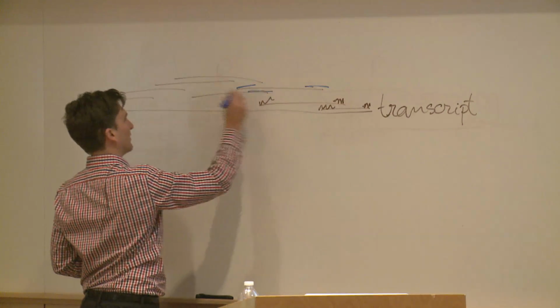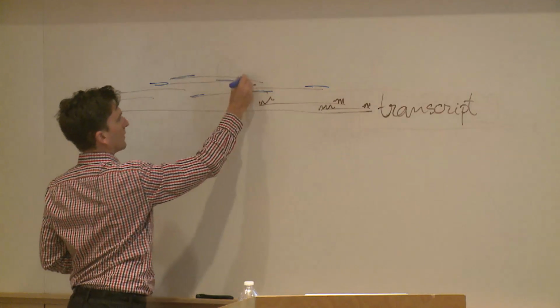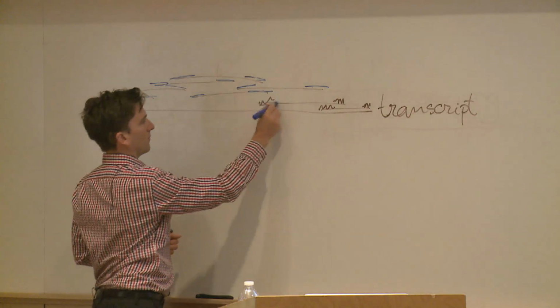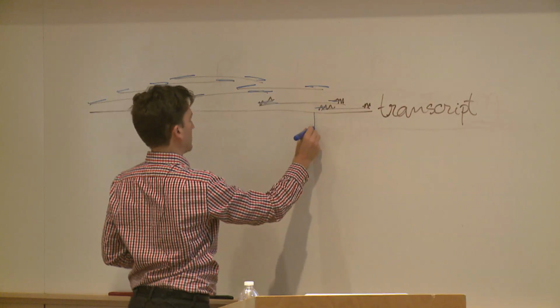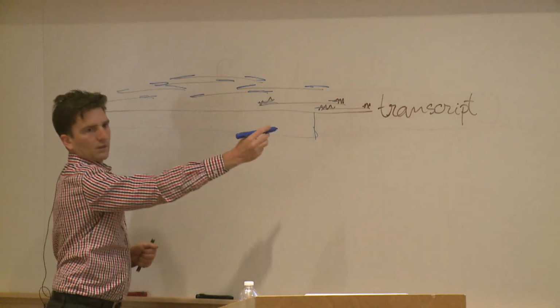Yeah, it's working. Okay, so what we're going to sequence is those blue bars here. And so what we consider the effective size is that size here. Okay?